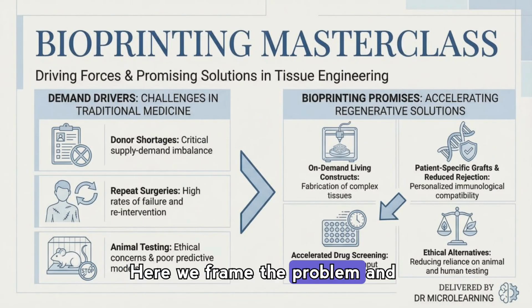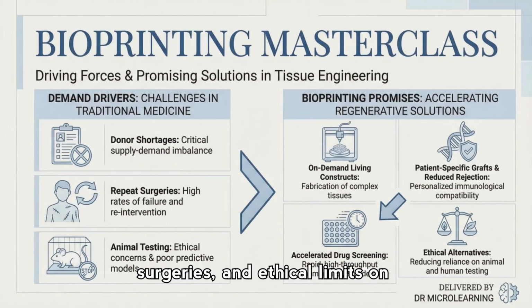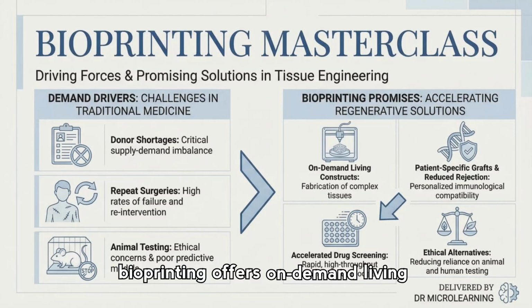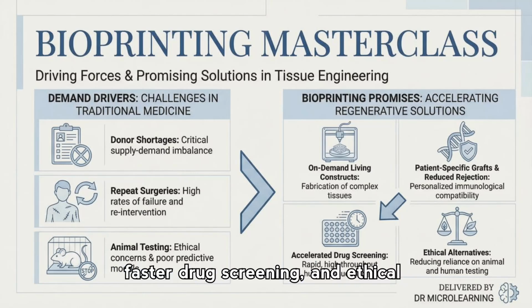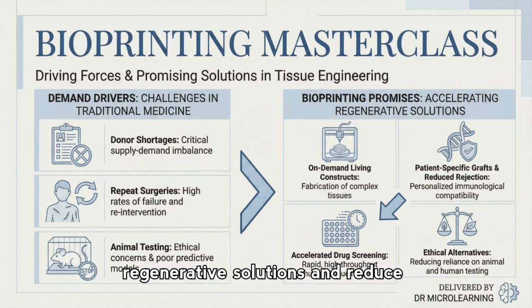Here we frame the problem and promise: donor shortages, repeat surgeries, and ethical limits on animal testing drive demand, while bioprinting offers on-demand living constructs, patient-matched grafts, faster drug screening, and ethical alternatives that could accelerate regenerative solutions and reduce reliance on scarce donor tissue.